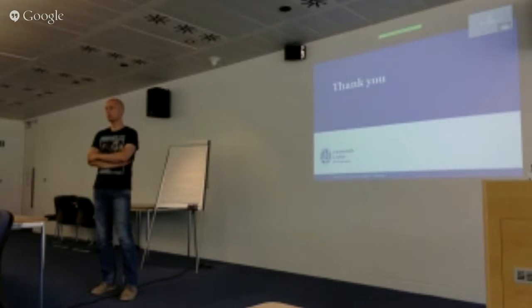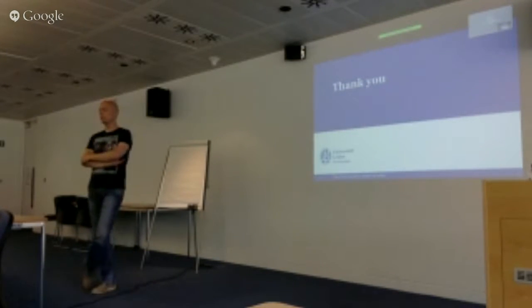Currently, most platforms can be compared, and most data formats, even GC, can be covered. But the community pickup on it is quite small. We tried this by raising hands and looking at how many people actually do it. If not everyone gets the same response, you won't convert it. The software is very varied, so even if the tools are perfect, adoption is not necessarily the same.